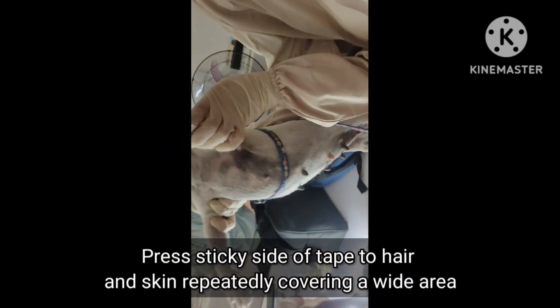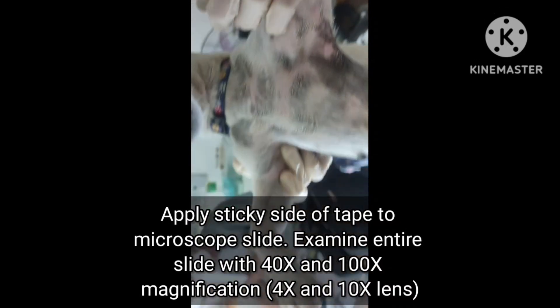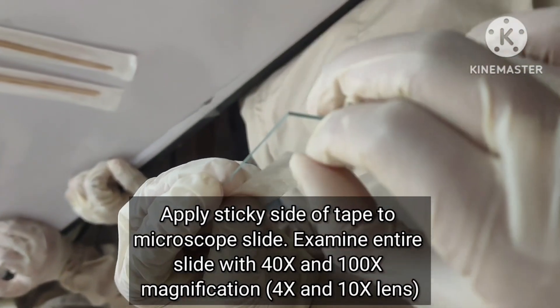Press the sticky side of the tape to hair and skin repeatedly, covering a wide area. Apply the sticky side of the tape to microscope slides. Examine the entire slide with 40x and 100x magnification.